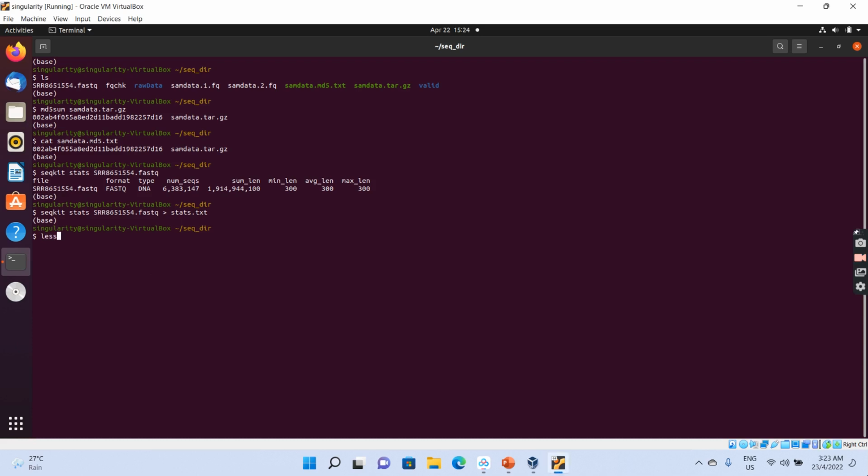Just type less dash S followed by stats.txt.